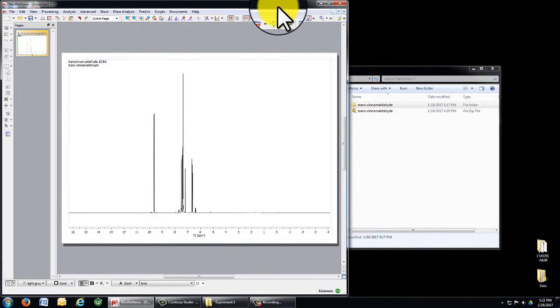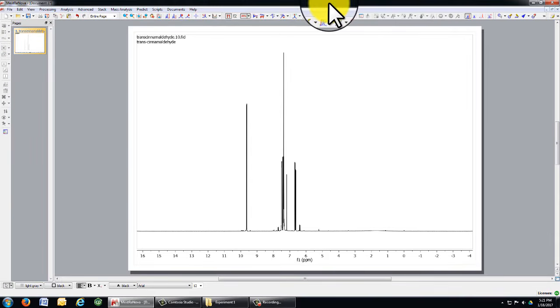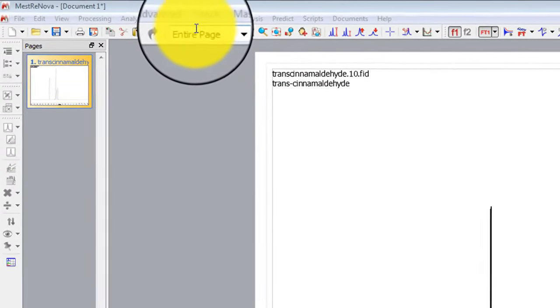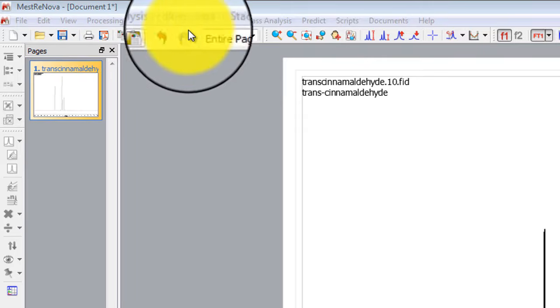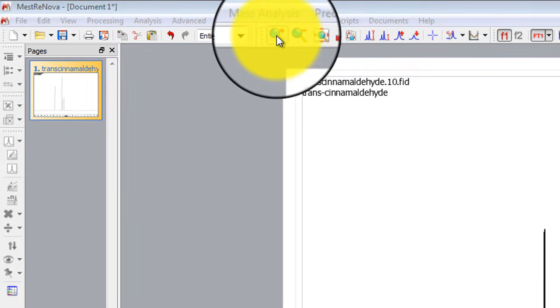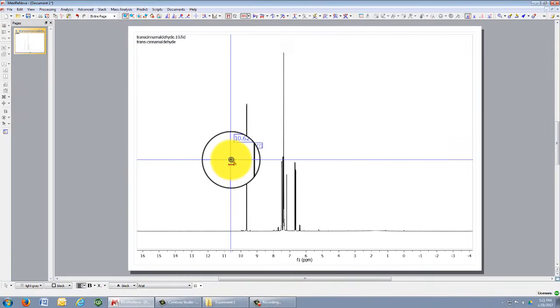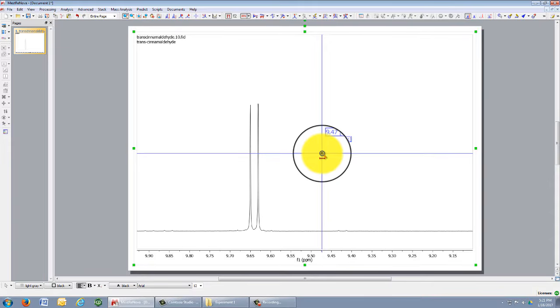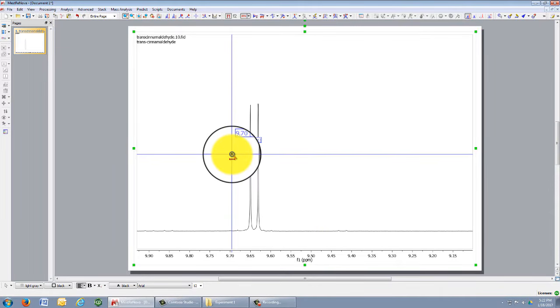Now to familiarize yourself with the program, you ought to know all the toolbars and the icons they represent. So above, you see there are many toolbars. Let me introduce them to you bit by bit. On the top here where my cursor is placed, we have a zoom in function. There's a shortcut where you can hold your mouse cursor and drag to the area that you would like to zoom in on larger, so you can focus more to see it more clearly.